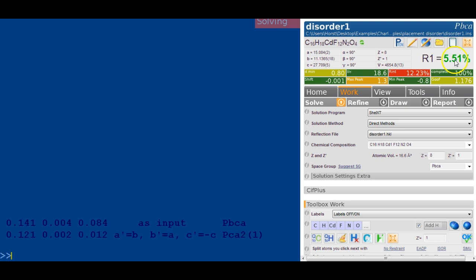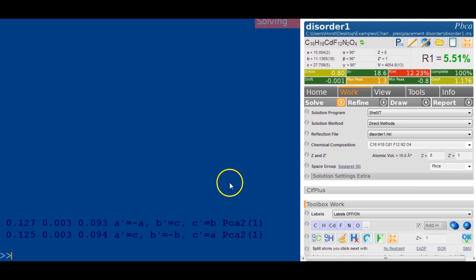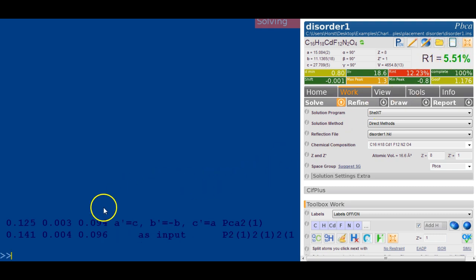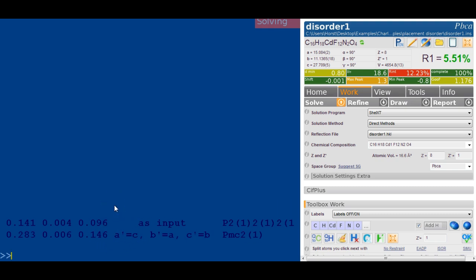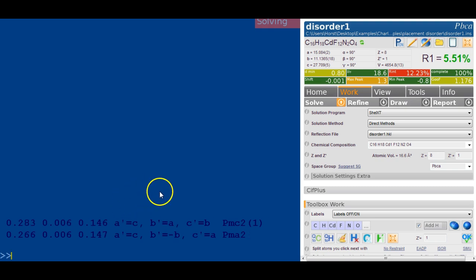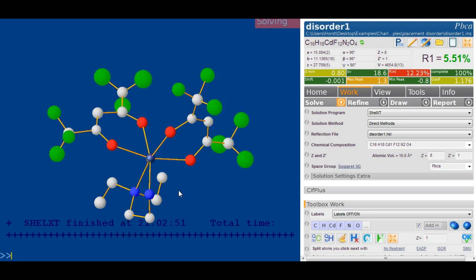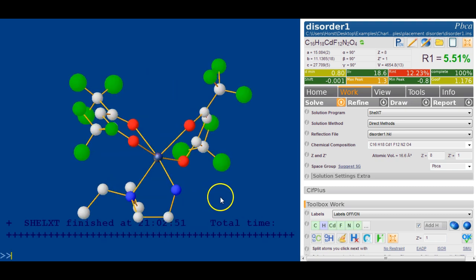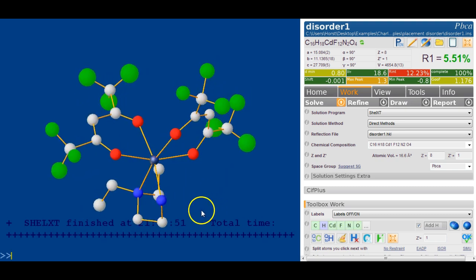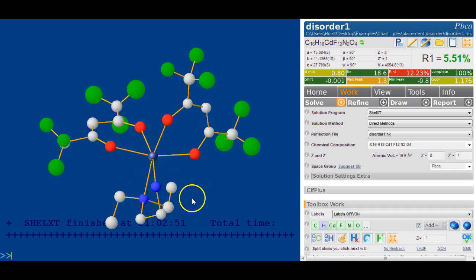The final R factor was 5.5%. Shell XT is working away, giving you an output about the potential space groups, and my recommendation is to just go with whatever it says initially. It does an atom type assignment, and it looks fairly good. The structure looks like it's clearly solved, and the atom types have been assigned rather well.